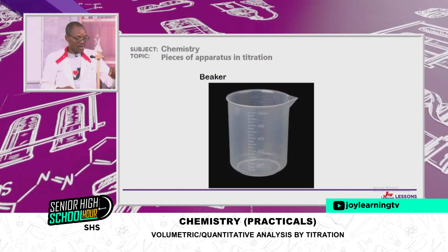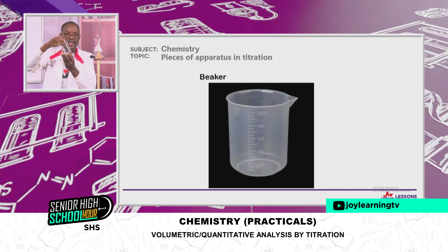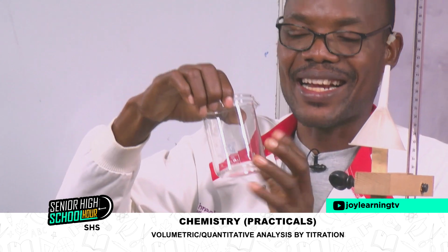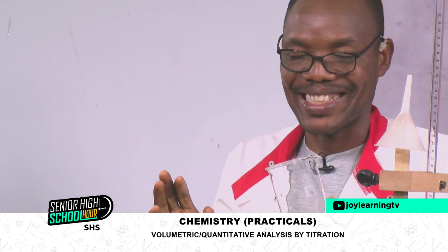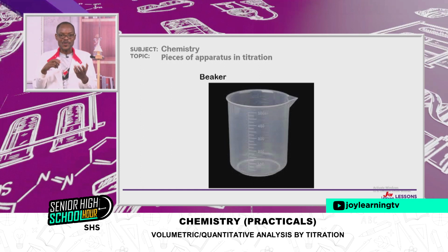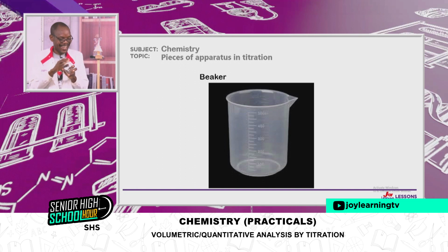The next one on our list is the beaker. The one on your screen is a plastic beaker. The one with me here is a glass one. And because you people are good at breaking things when you are in the lab, you may not have the glass beakers. If you have the plastic ones as on your screen, there is no problem for it. This is to prevent high level of damages because it's a glass. Once you are a little careless, it will break. You cause financial loss to your school. So when you have the glass ones in your school, take your time whenever you are using it. Okay?